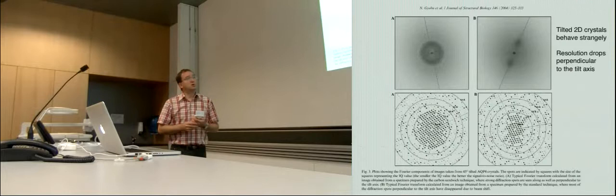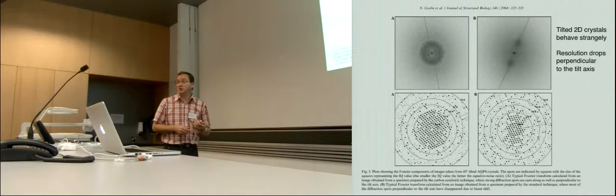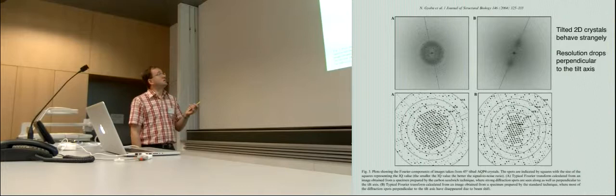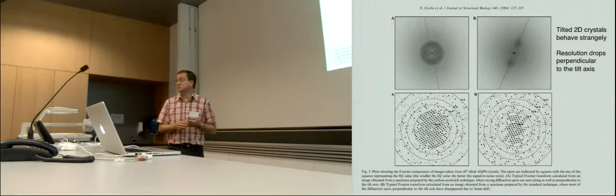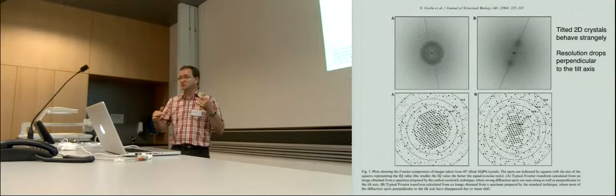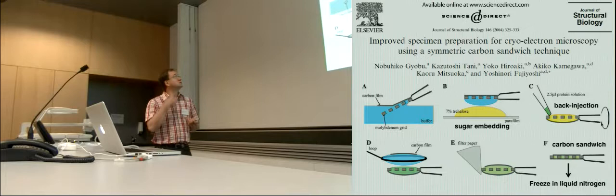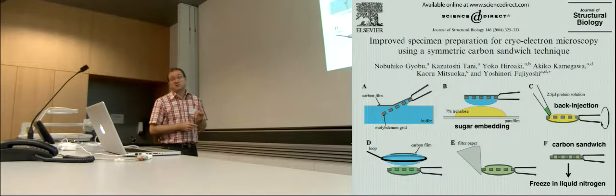Also, once you start to tilt your sample, you notice that they behave strangely. And this is from Gyobu et al. You see that the tilted at 45 degrees show a loss of resolution perpendicular to the tilt axis. And it is thought that it is mainly due to charging and drift. And they describe in that paper that there could be an improved preparation of the cryo-electron grid to help.